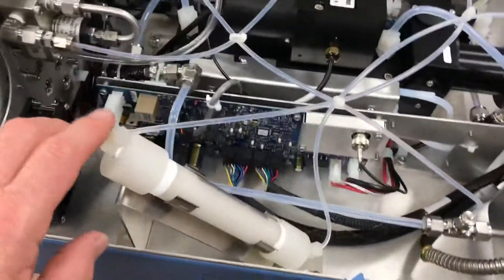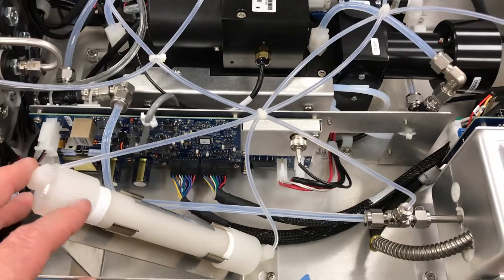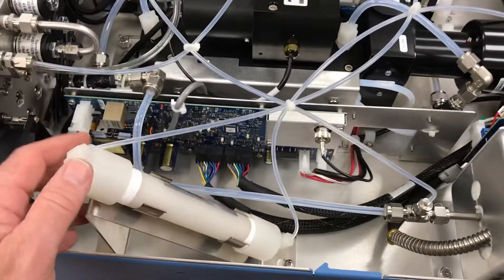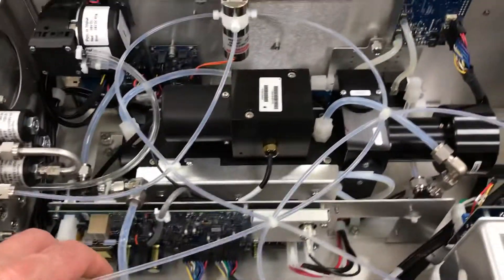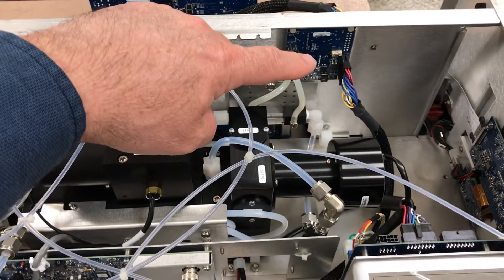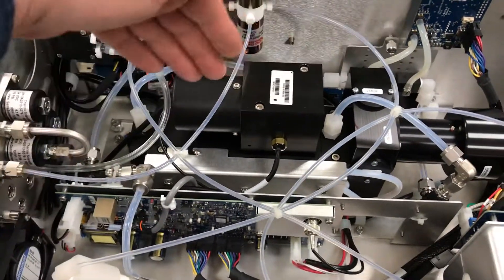Looking over to this side, we've got the SO2 scrubber, similar to the previous I-Series scrubber, but it used to be mounted up at the front of the instrument. They've put it on its own bracket on the left side of the instrument for easy accessibility. The interface board is gone as it was in the I-Series instrument — they've done away with it and redesigned this board here for control of the reaction cell assembly.